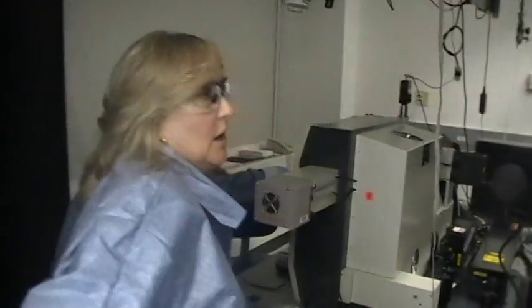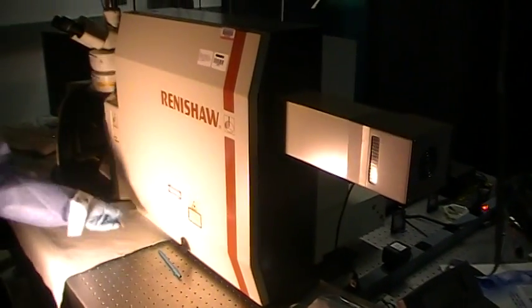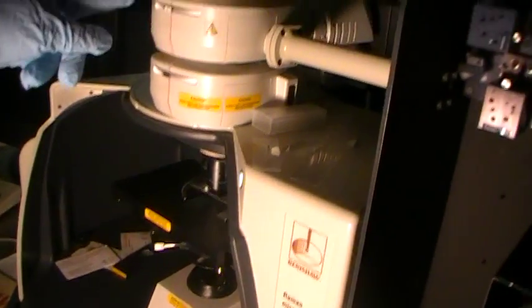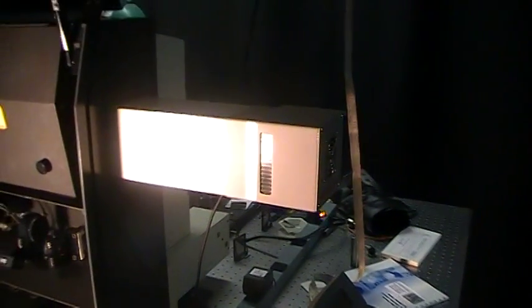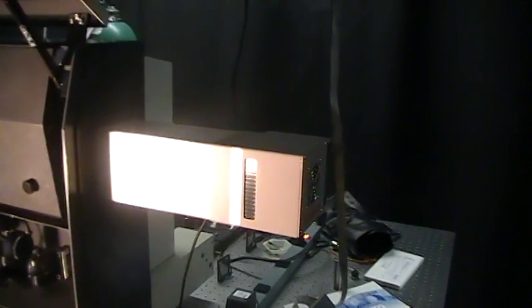As we go in here, this is the Raman microscope — the Renishaw. What's actually happening is this is working with a laser inside, and the laser comes from that hole here, goes this way, goes up, then goes to the microscope, and then down to the sample right there under the objective. Then the signal comes back, goes through the filter, through the slit, and there's a grating inside. You can see the grating inside. Then it disperses the light, goes into the detector right here, and we can read this information onto the computer — we run all this through the computer.